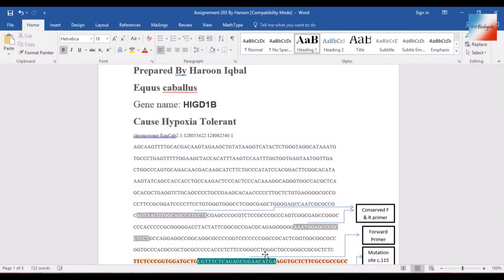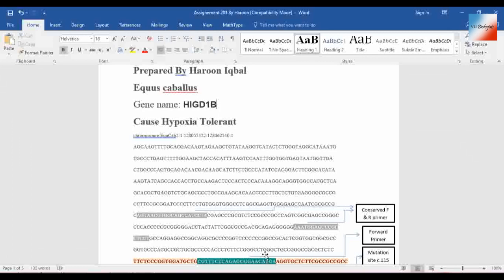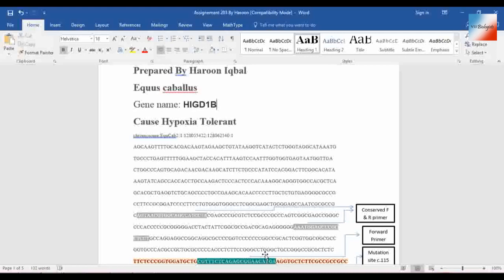Assalamu alaikum, today we will learn how to get gene sequences from NCBI or Ensembl websites for any gene of any animal. First of all, we need to know which sequence we are looking for. That should be a specific phenotype or disease.